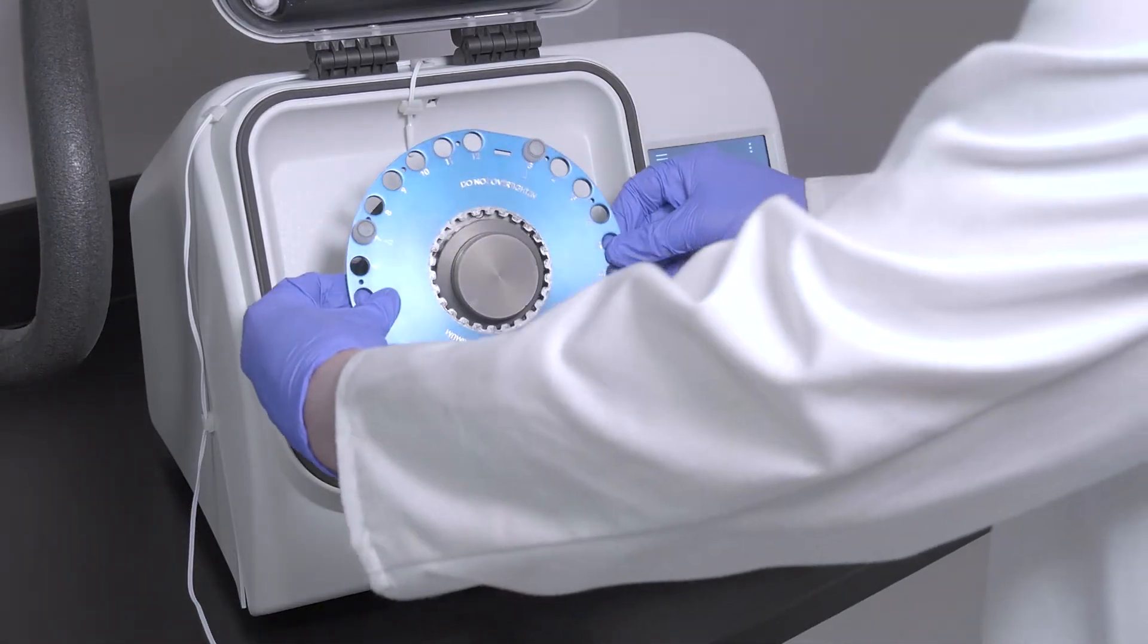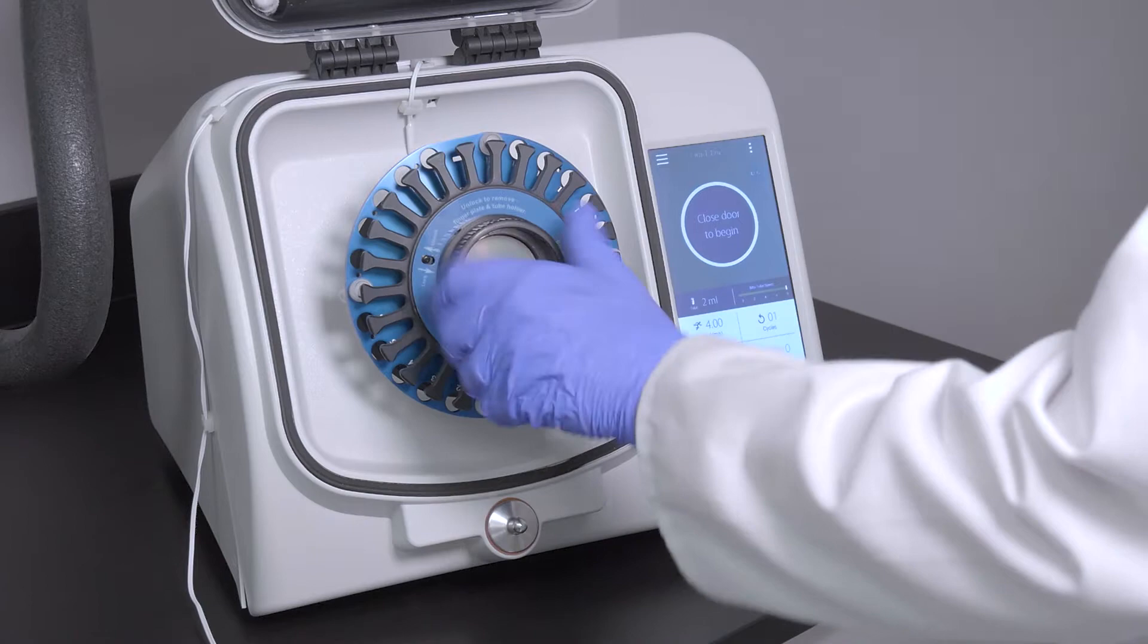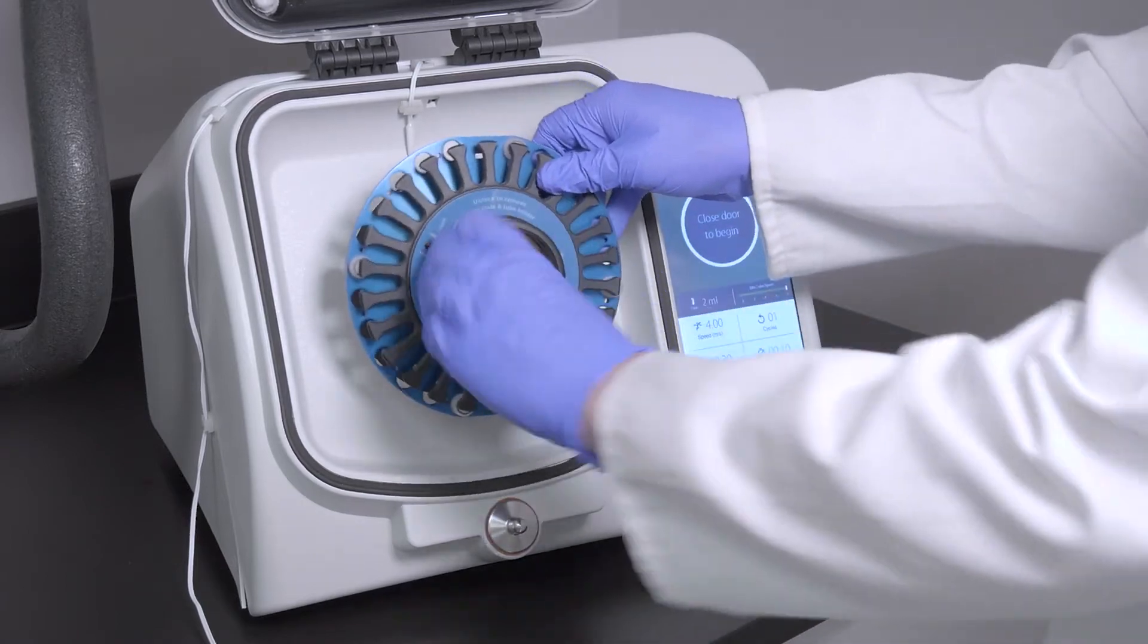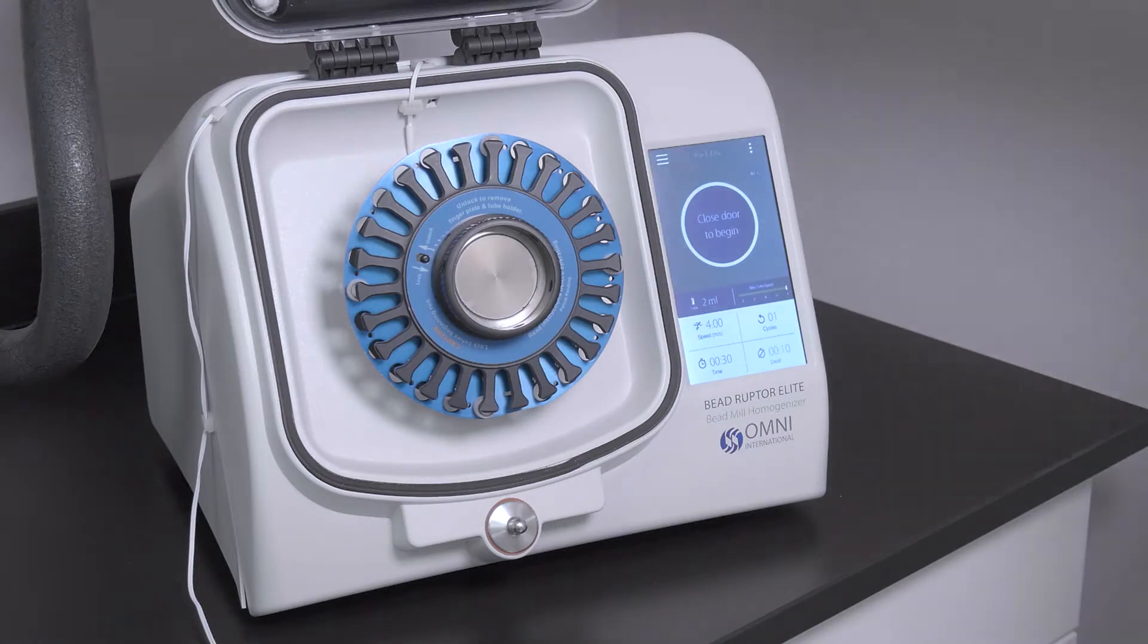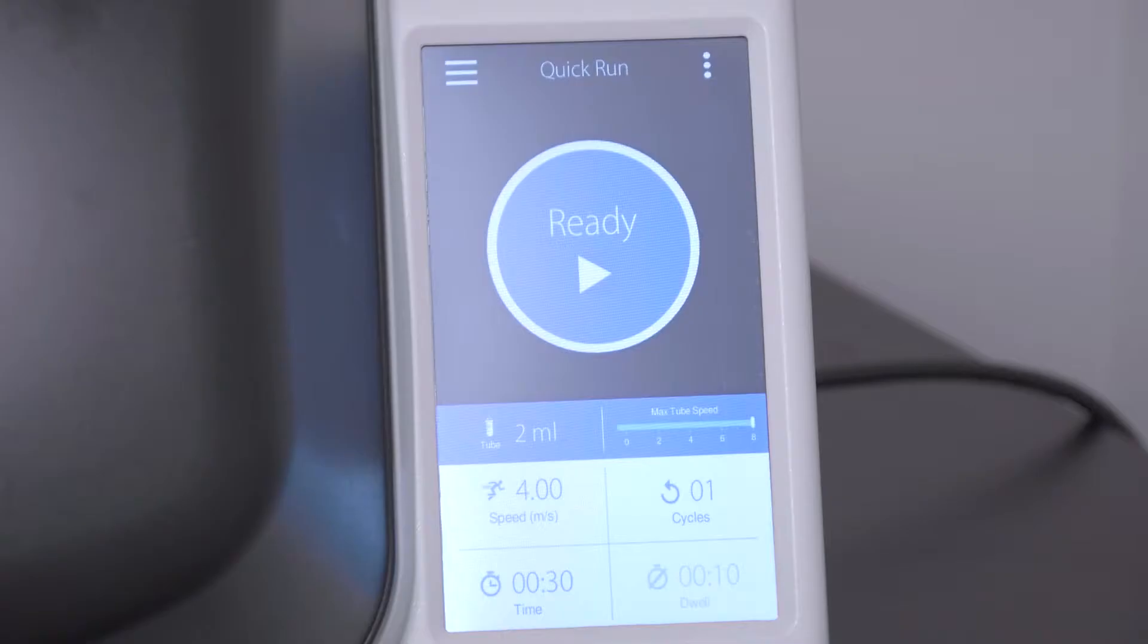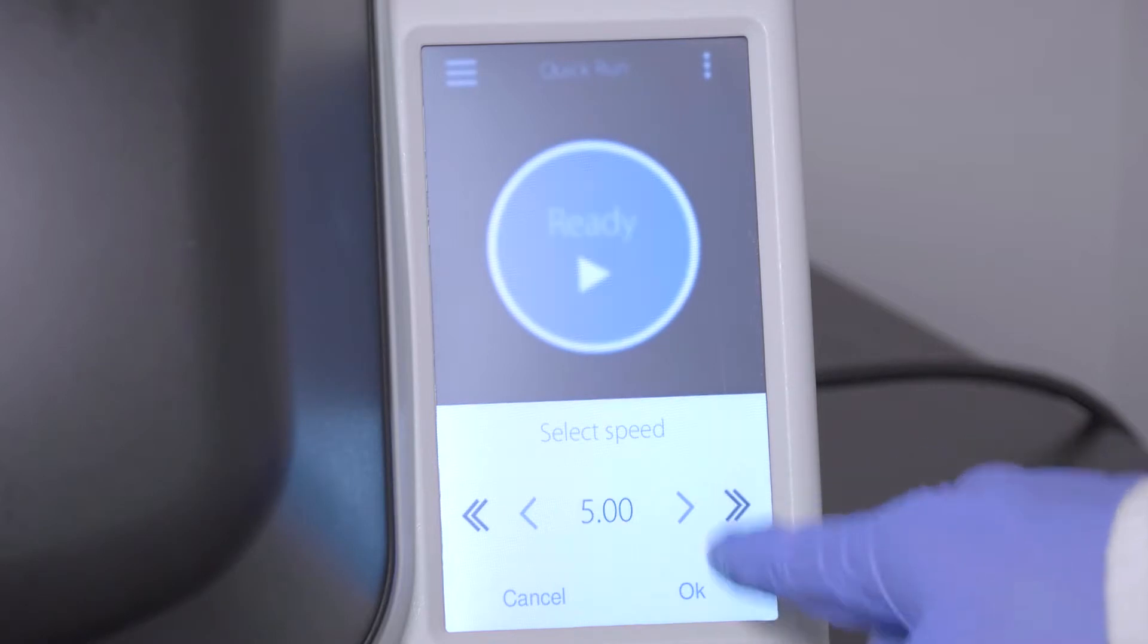Load your samples into the BeadRuptor processing chamber. Fasten the finger plate securely and close the lid. Input your desired time, speed, cycle, and dwell settings.